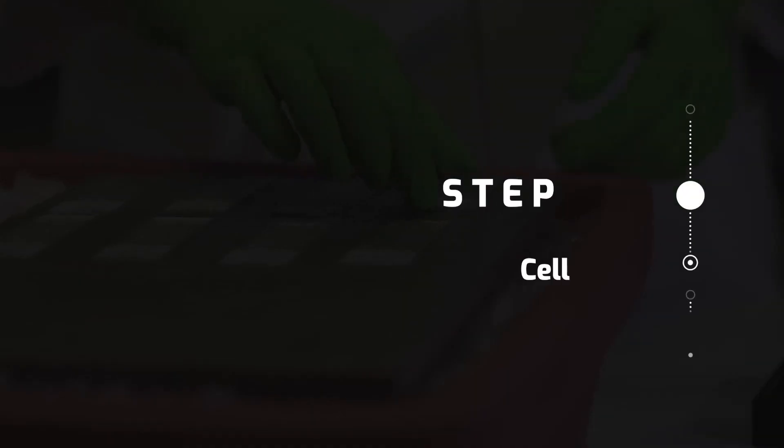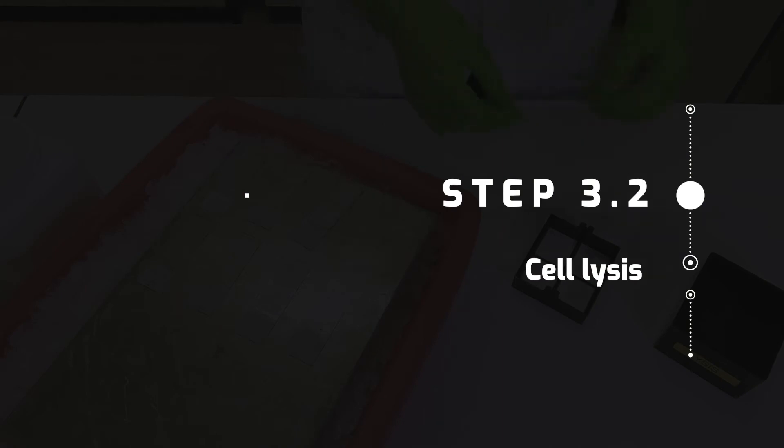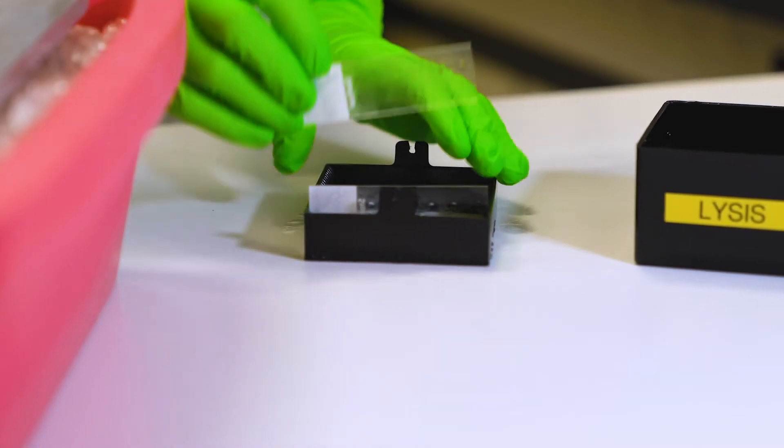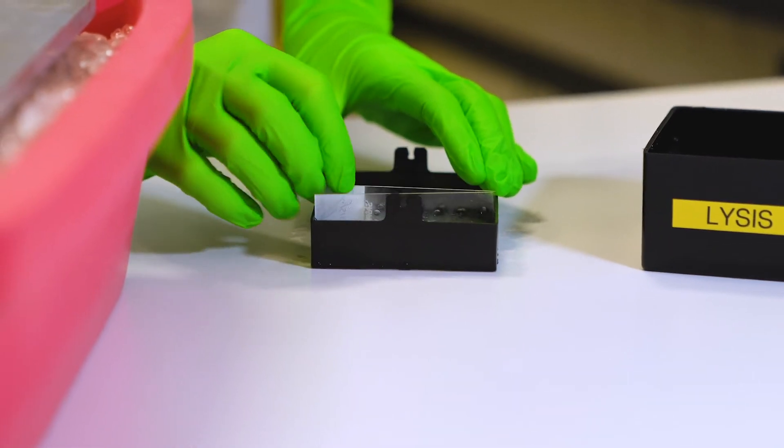Lysis step. After about 2-3 minutes on the metal cold plate, transfer the slides containing the 12 mini gels to the lysis solution.